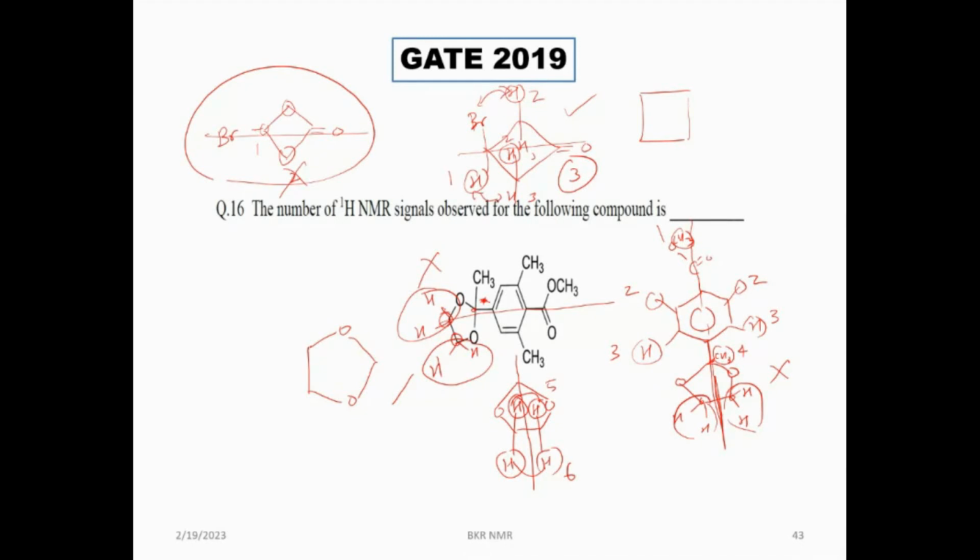But what have we used? We are using the plane of symmetry. It is the same here. The hydrogens on top are closer to the methyl, while at the bottom there is no methyl. So the top hydrogens have methyl proximity, but the bottom ones don't have any methyl proximity. So we discuss using that point. If you look in books or on websites, they may have given it wrongly. This is the way you should argue.